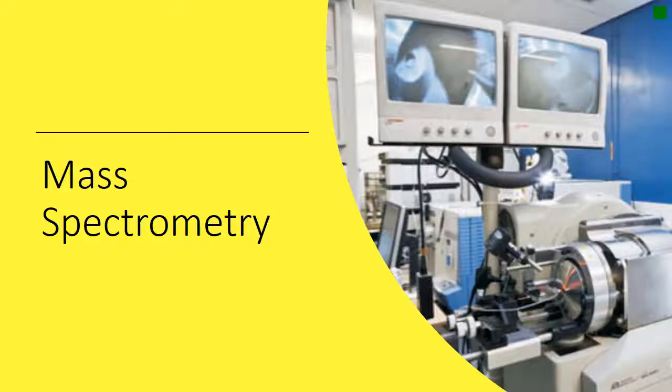Hi, this video is on mass spectrometry, which we did meet in an earlier topic, when the purpose of studying mass spectrometry was to work out the Ars of elements from the isotopic mass numbers. But in this case, we're going to look at putting organic molecules through mass spectrometers and have a look at identifying such molecules.